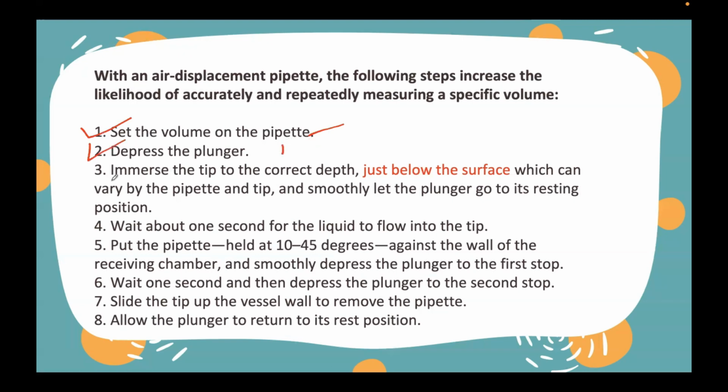Next, immerse mo na or ilubog mo na yung iyong tip doon sa pinaka-tube mo sa correct depth. Ano po yung correct depth niya? Just below the surface. Okay, kunwari ito yung iyong tube, meron kang liquid dito. Pag sinoke mo yan dito, just below the surface. Hindi po sasagad dito. Hindi masyadong mababaw dito, dapat just below the surface.